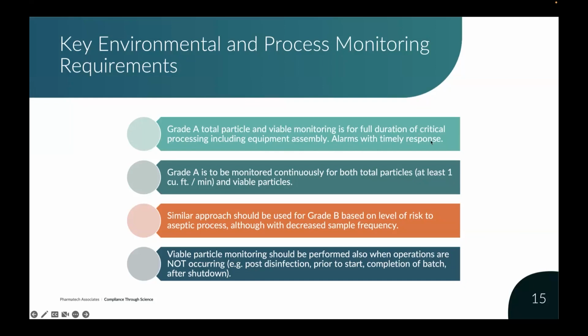There should be alarms with a timely response. Is there a light in the room? Is there a notification from someone? Is there a person monitoring these total particle systems? Now, obviously, with viable monitoring, you can't have a timely response because you don't get the results until later. Although there is a desire to have more rapid microbial methodologies, not everyone has those. But the idea is any alarm system should be telling the operator as soon as possible, so that some correction could be made.